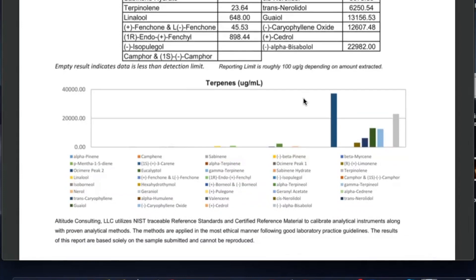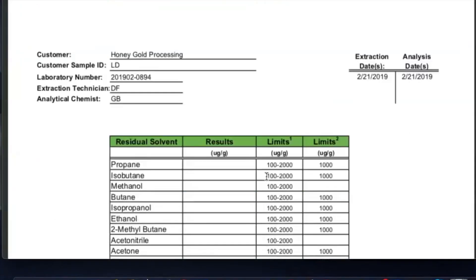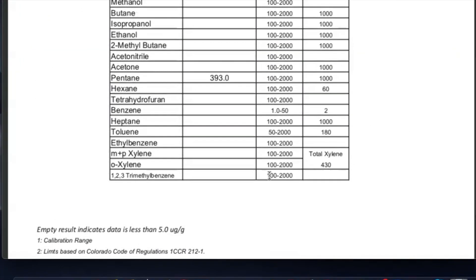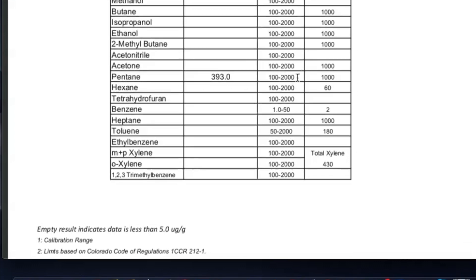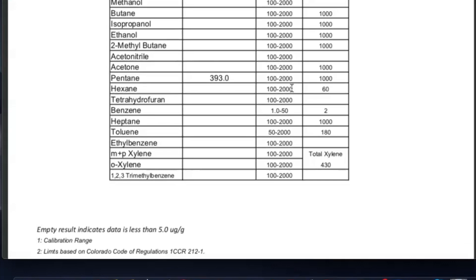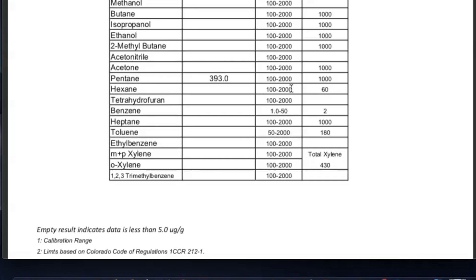Next we'll pop over to the solvents. This is actually a solvent result from a product that somebody had sent us samples of. We didn't wind up going with it because when you look at the solvents, you can see that pentane showed up — it was within their range of testing — and this is not something that we wanted because we did not want a product that had any solvents used in the extraction.